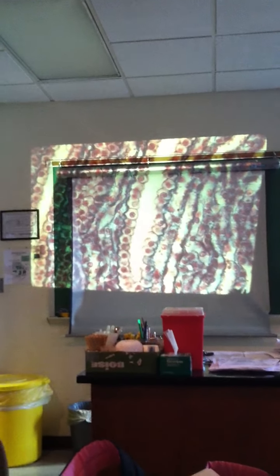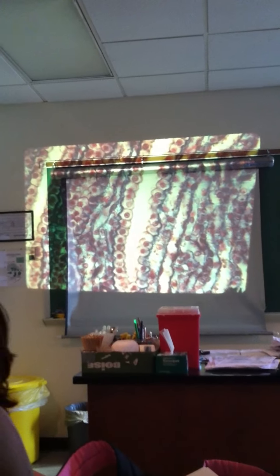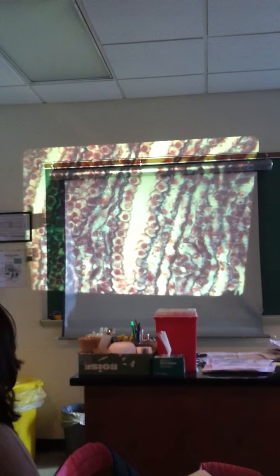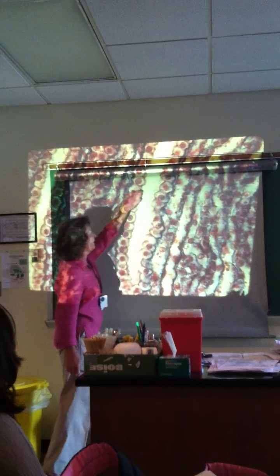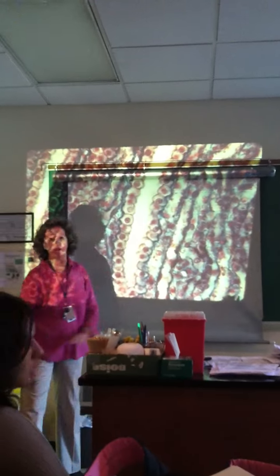This one you were assigned. Maybe this wasn't the color of yours, but you were assigned kidney tubules. So name this tissue that makes up the wall of the tubule. Simple cuboidal epithelium. Yours was dark pink versus light pink instead of pink versus gray or whatever color that is. Simple cuboidal epithelium. Any questions?